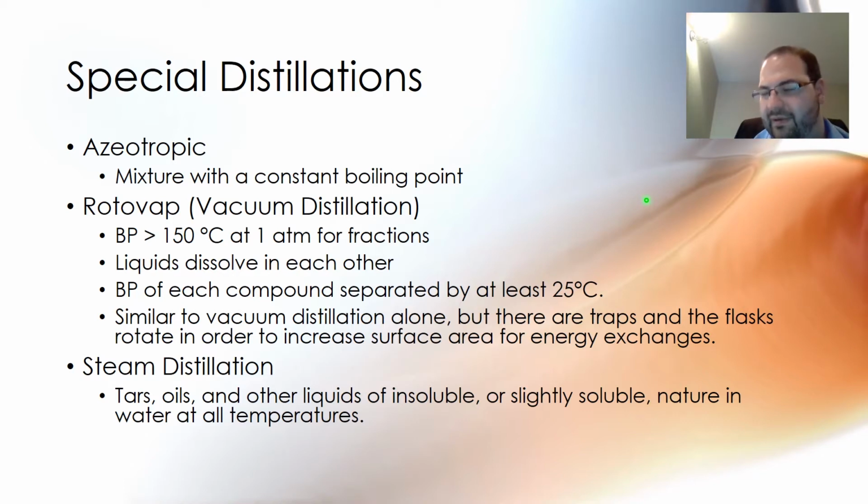or those little mesh fiberglass rheostat-based thermo wells that you sometimes see in research labs that aren't the typical ceramic thermo wells that you all get to use, those don't reach temperatures much greater than 150 super easily, in a way that maintains it very well.